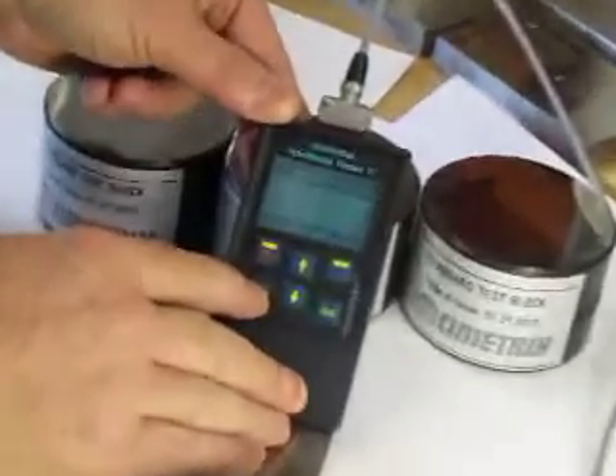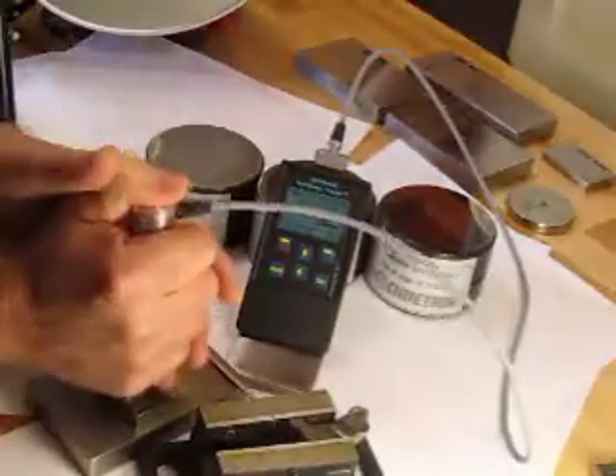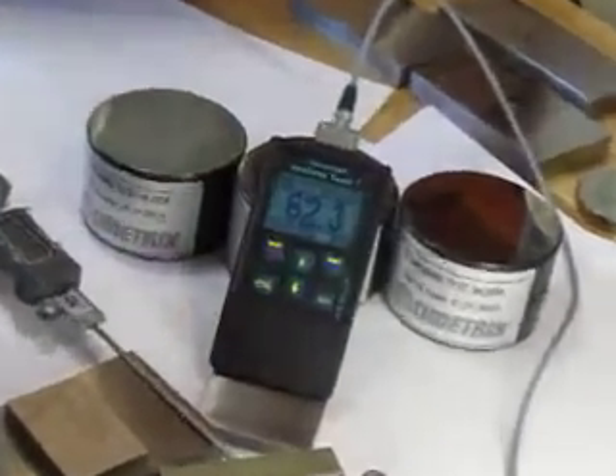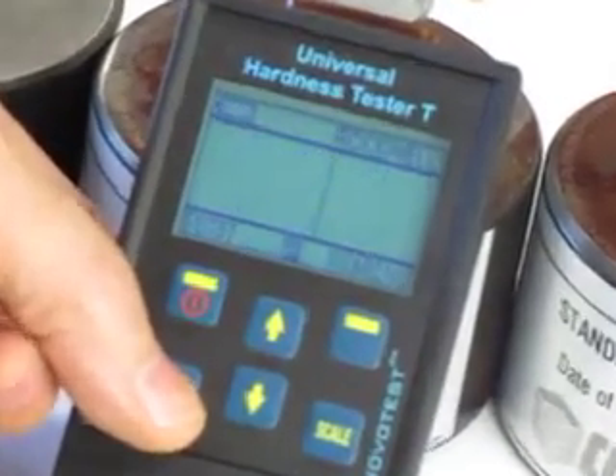With the display, we can also set it up to show the average of a number of values in a test, or a single value. To do a test, I take my test probe which has a Vickers diamond tip on the end, carefully place it on the part, push down, and when the device beeps we have a result. Here we have 62.3 Rockwell.